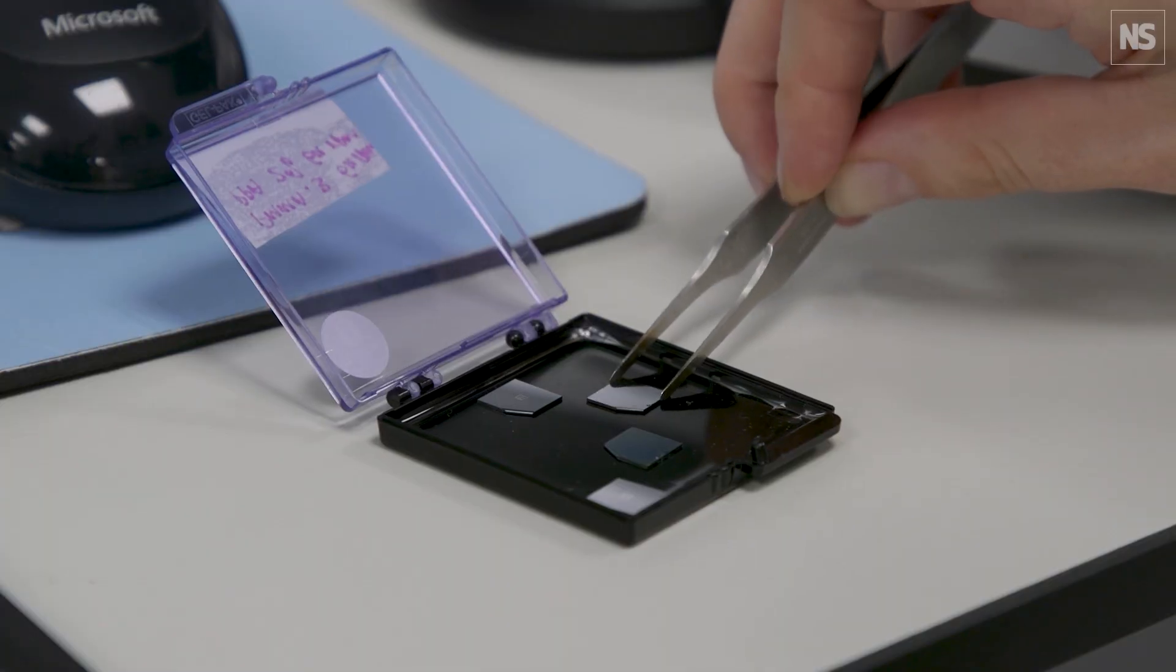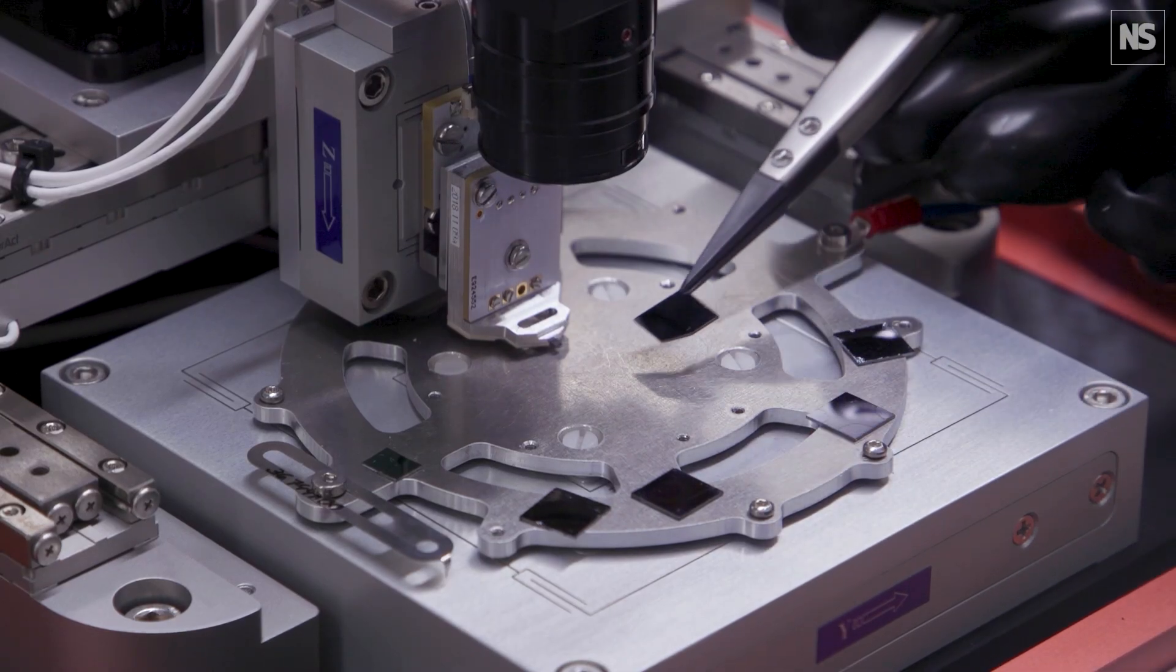To create the world's smallest violin, we have a multi-step process. We start with our clean chip and put it into the glove box where we coat it with a very thin layer of polymer.